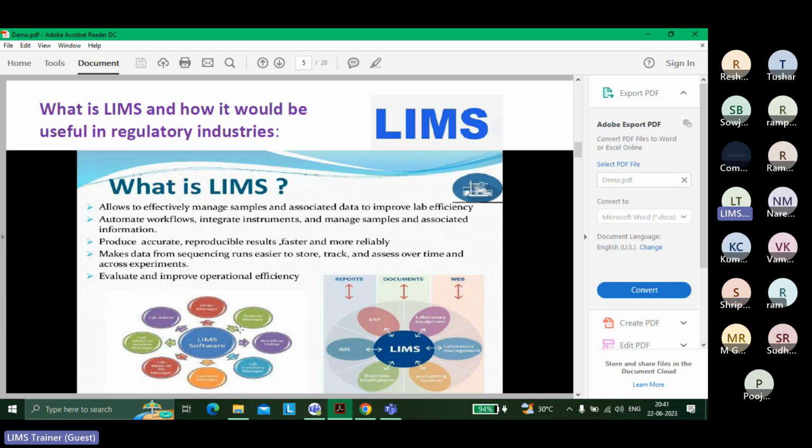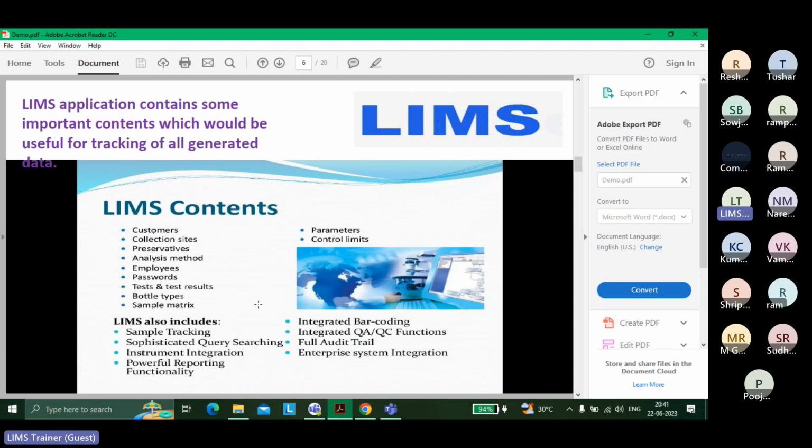And one more thing, what is LIMS? It's not only LIMS, right? We can connect LIMS with instruments, we can do instrument integration. We can connect it with chromatographic tools, right? I believe any of you who have worked on Caliber LIMS, there should be some integration with any chromatographic tool, so that it directly takes the chromatography values and pulls them into LIMS. Basically in industry we use SAP and LIMS and chromatography CDS software linked with HPLC, the integration between these.